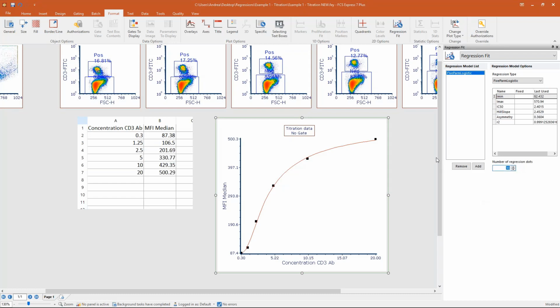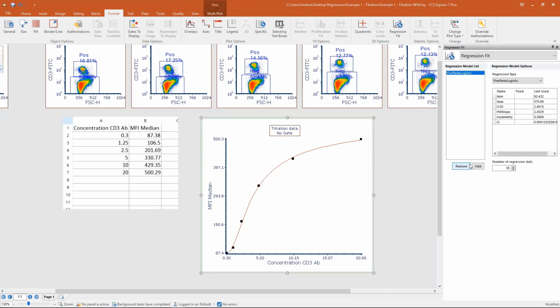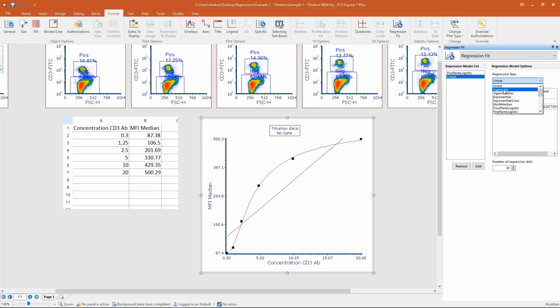In this dialog, we also have the ability to add a new regression on the same scatter plot. If you click on add, a second regression is automatically added. By default, it's still linear. Now you see it's blue. This is very simple: you have the slope, the intercept, and then the R-square. And you can change it. Let's say, I don't know, sigmoidal. And now I have 2 regressions. I can add as many regressions as you want. Again, you can play with the coefficients and the smoothing.